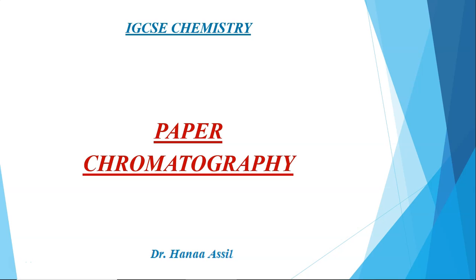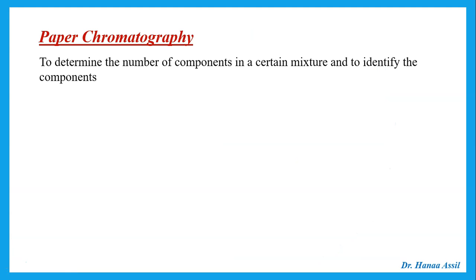Hello, this is Dr. Hanaa Assil, and today we're talking about paper chromatography. This is mainly for the IGCSE chemistry, but it could be basics for advanced level or any chapter on chromatography. So let us take a look at what is paper chromatography and how do we use it.